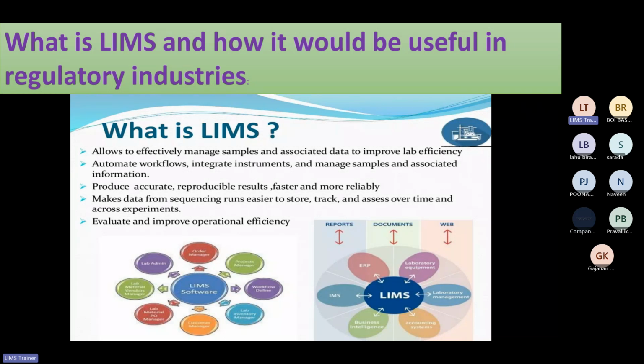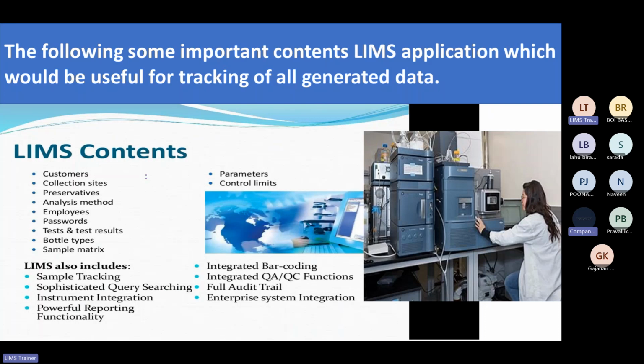So you all now have an idea about the software. Okay, so let's go ahead. So this is the content of that particular software.